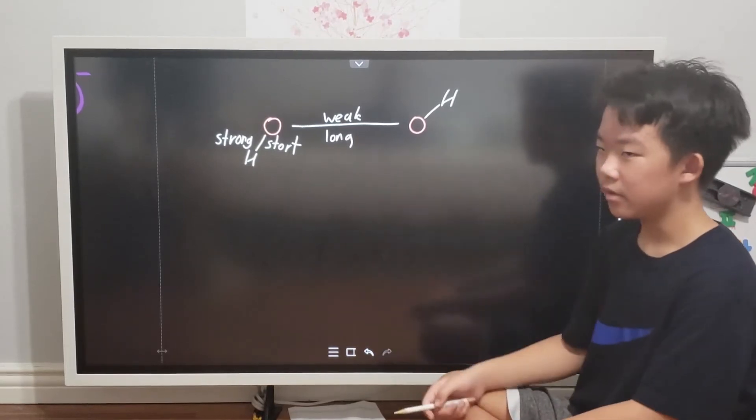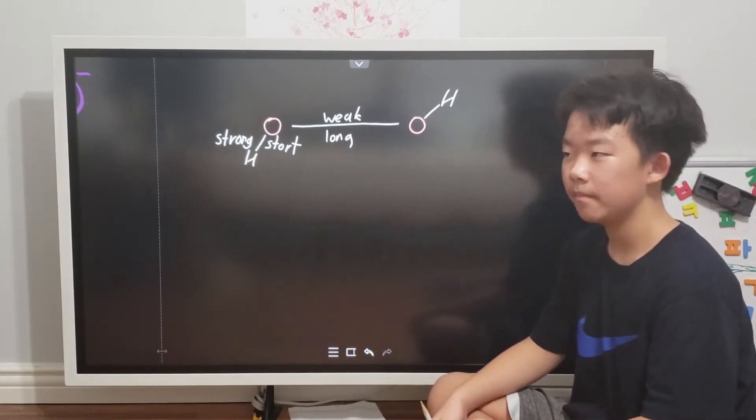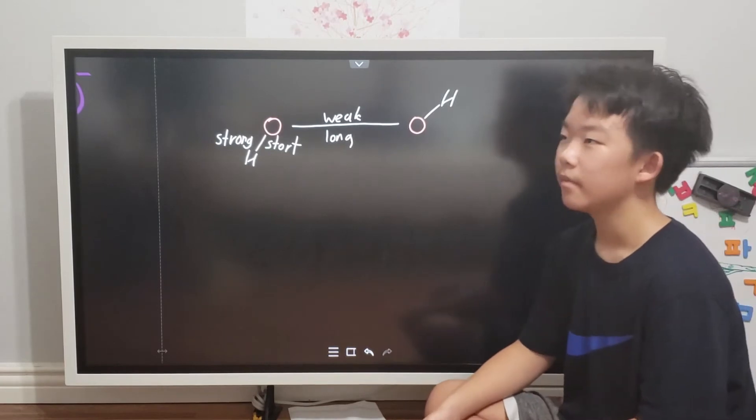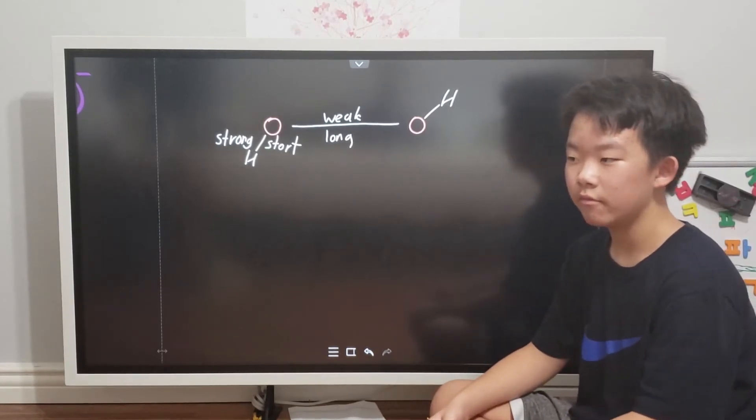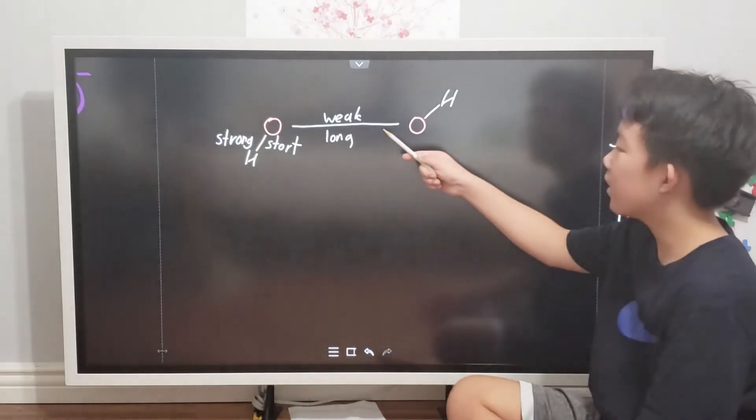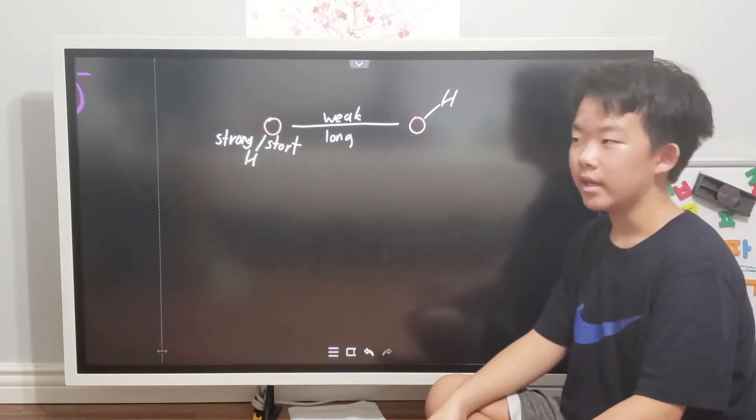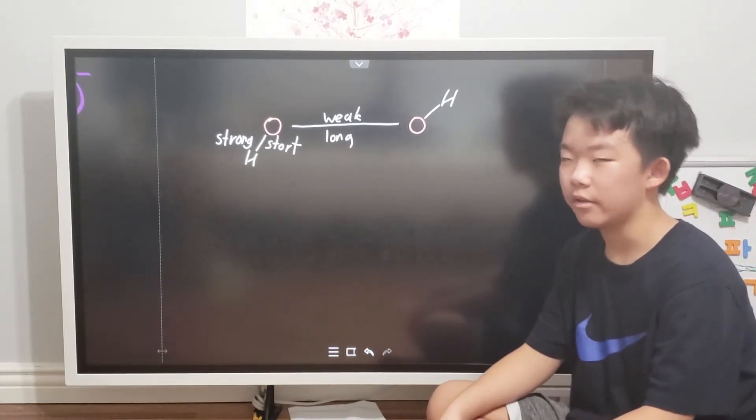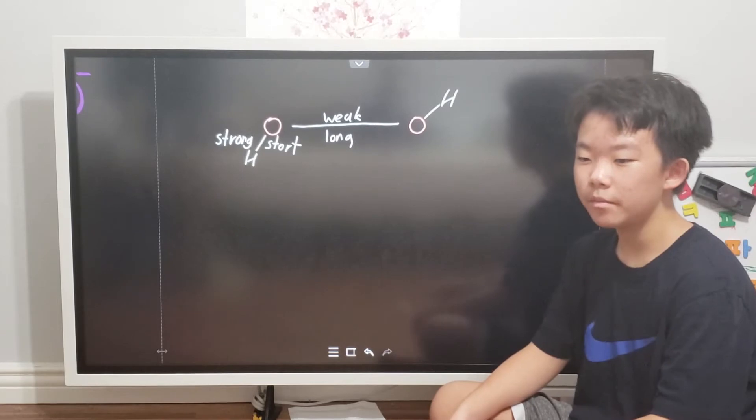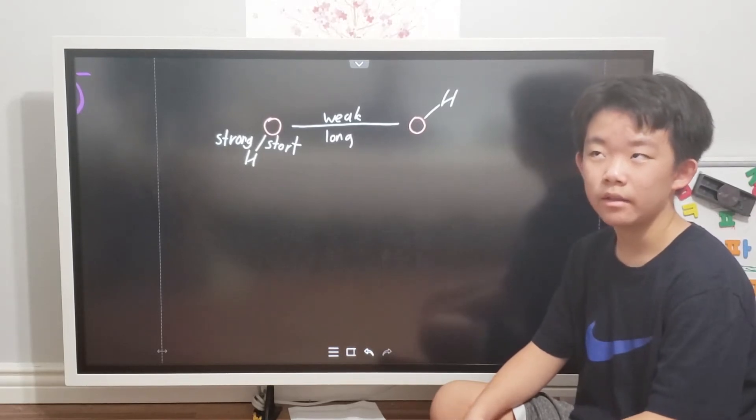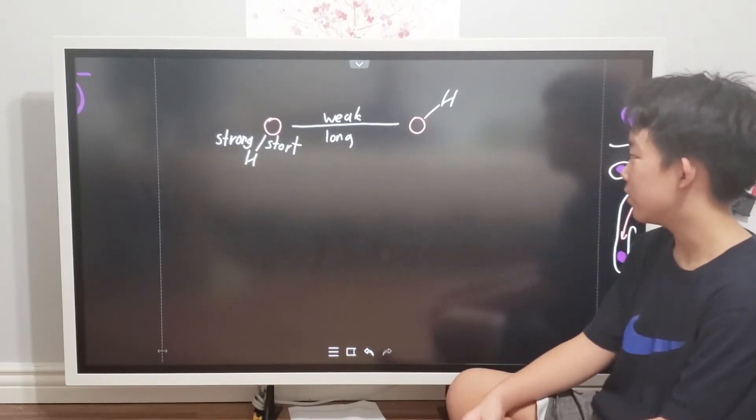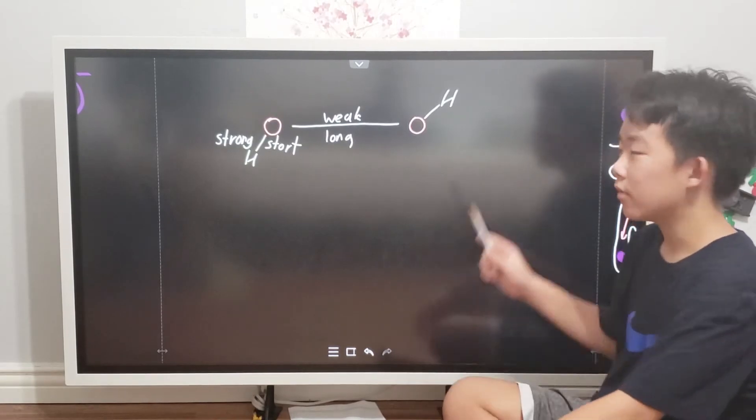Such as, let's see, yeast, because it releases catalase which can break the bond. Potassium iodide, like you just saw. And later we'll be using potassium permanganate to break the oxygen-oxygen bonds. But that's a thing for later.